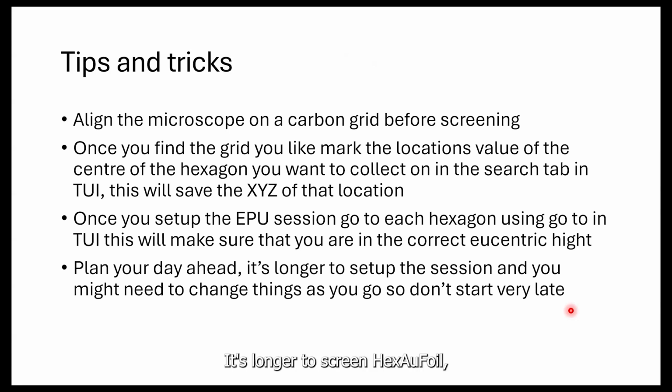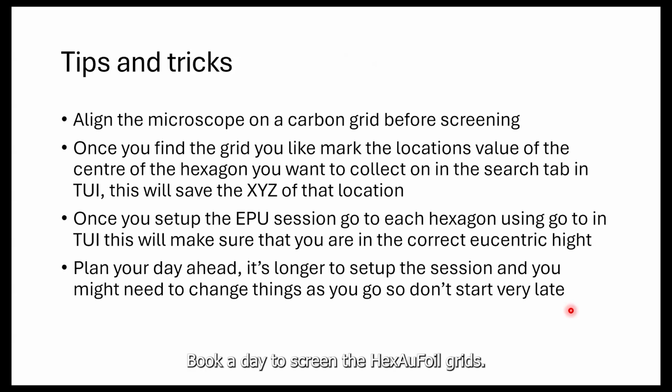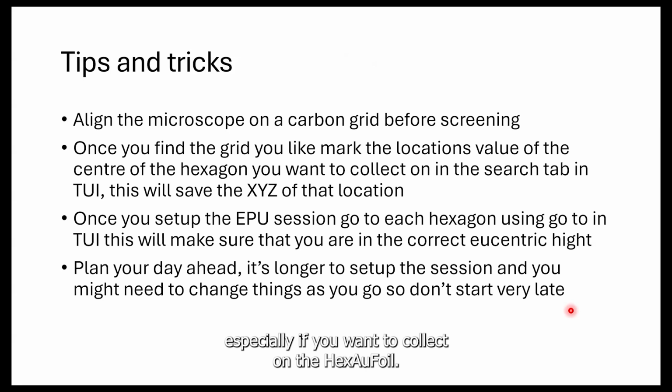It takes longer to screen HexAuFoils. It's not as easy, not as straightforward. When you have HexAuFoil grids and you want to screen them, book a day to screen the HexAuFoil grids. Not, I have 3 Quantifoil, 2 golds, 1 HexAuFoil, and I want to change parameters. This will make everything way, way longer, especially if you want to collect on the HexAuFoil.